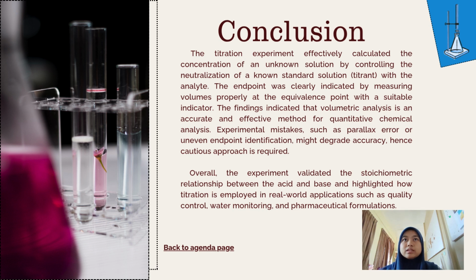In conclusion, the titration experiment effectively calculated the concentration of an unknown solution by controlling the neutralization of a standard solution with the analyte. The endpoint was clearly indicated by measuring volumes properly at the equivalence point with a suitable indicator.